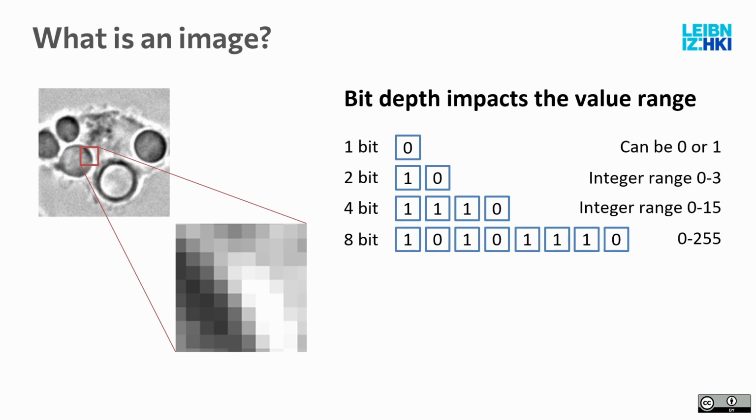So let's look at some of these bit depths that are available. Imagine if I picked out one of these pixels and showed what's inside there in binary code. If we have a 1-bit image, the pixel, if I print out the individual bits or memory that is in there, it would look like that here. 1-bit image, there's only one space with 1 bit. This can be only 0 or 1, and then nothing else, because there is literally no space afterwards.